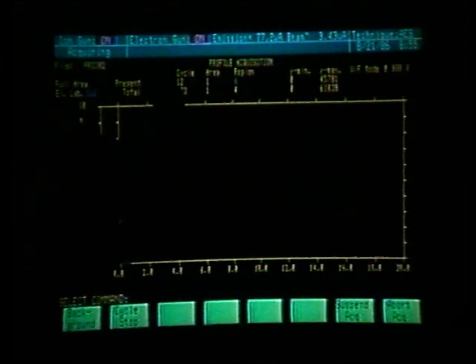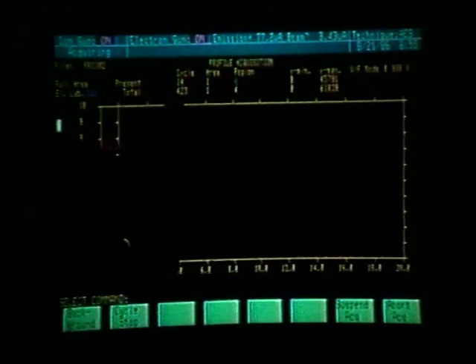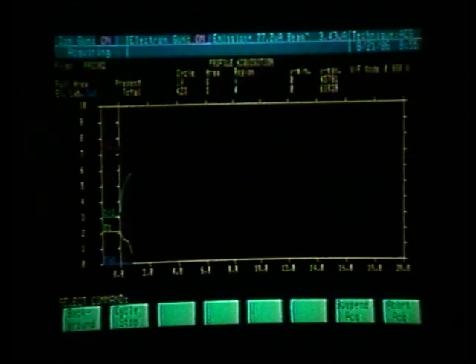Right now we are on cycle 12, and it has estimated that the total number of cycles for the 20-minute profile will be 423 cycles. That's 423 data points per element. Again, on the window profile, for the same amount of time, we were set for 42 data points. We have a factor of 10 more data points using the two-point profile mode.